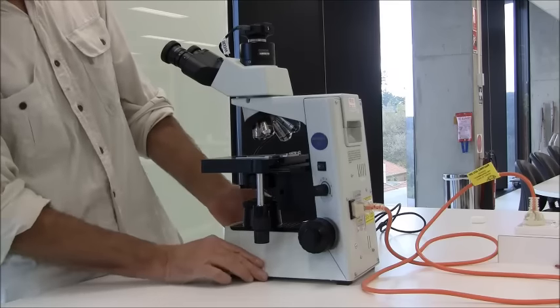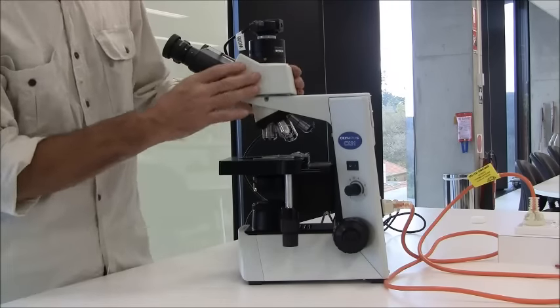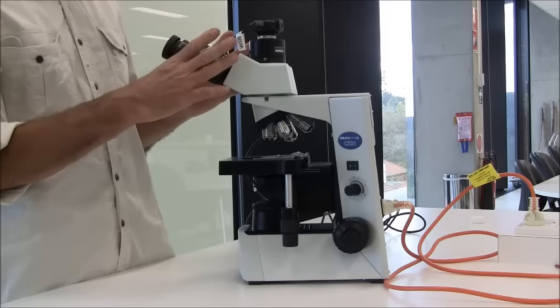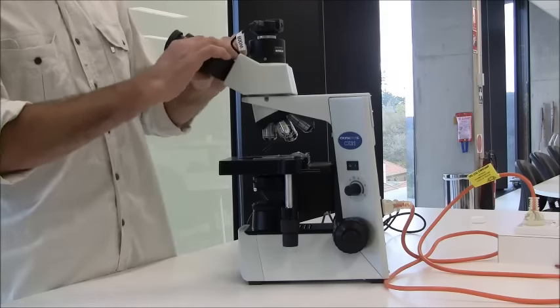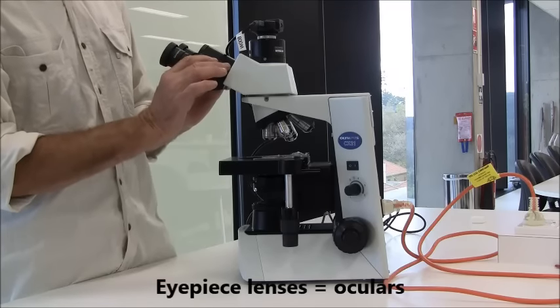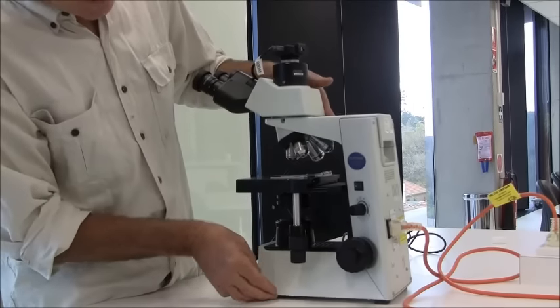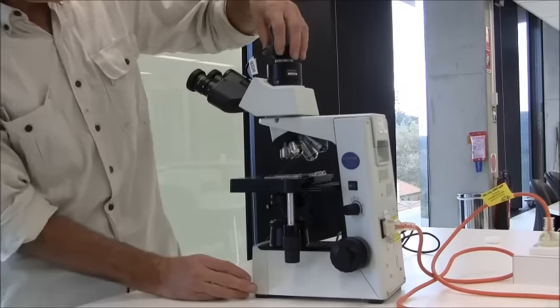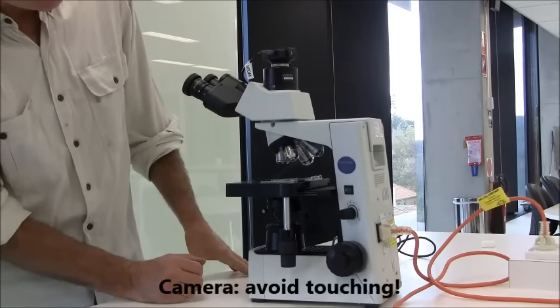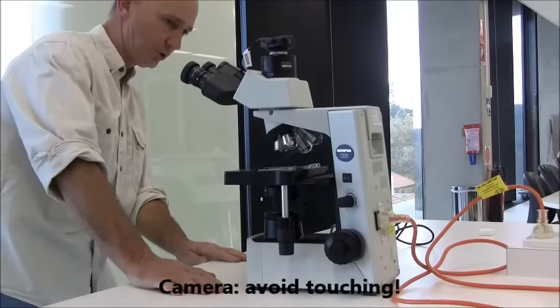The next part is the eyepiece lenses, where you're able to adjust the interpupillary distance, or the distance between your eyes. And then on the top is the camera, so the image can be sent to your computer. I think I've got all the parts.